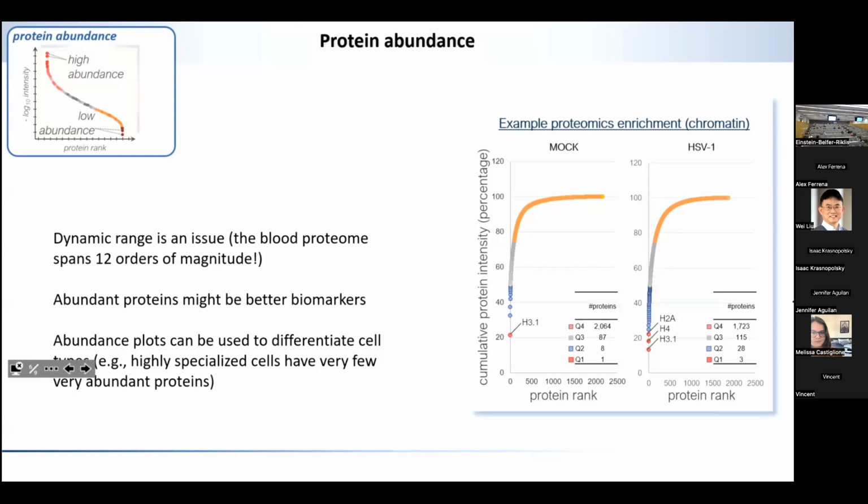If you take a muscle cell and you want to do proteomics, let's say you do transcriptomics on that, you can probably easily see 10, 15,000 RNAs. If you do proteomics of that, 95% of that proteomic data is myosin, right? So the more a cell is specialized, the more a few proteins define almost the total mass of the cell occupancy. So that is something else to keep in mind.